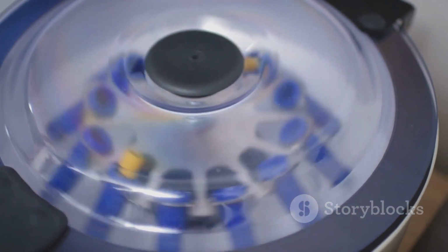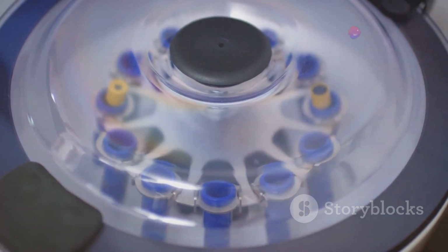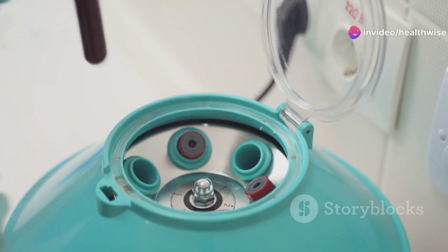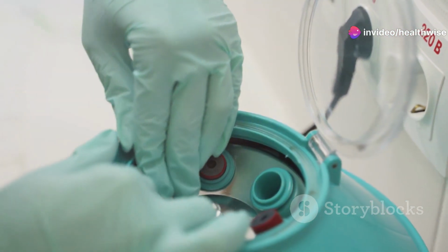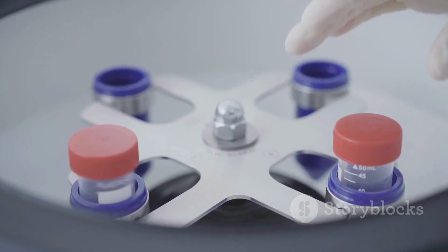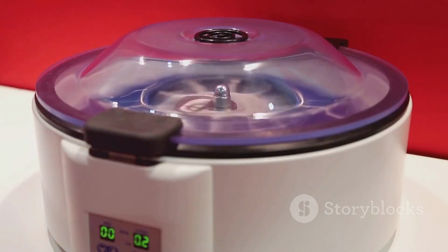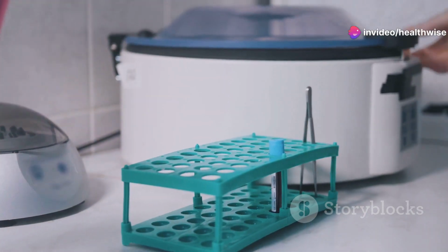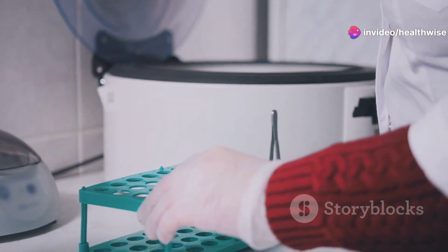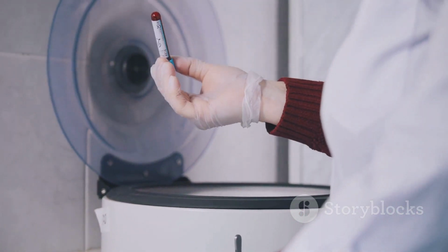Horizontal head centrifuges. These are the workhorses of the lab, used for a wide range of routine tasks. Their rotors spin horizontally, and they're great for separating blood components, pelleting cells, and other general-purpose applications. Fixed angle centrifuges. These centrifuges have rotors that are fixed at an angle, usually between 20 and 45 degrees. This allows for faster and more efficient separation, making them ideal for high-speed applications like DNA and RNA isolation.